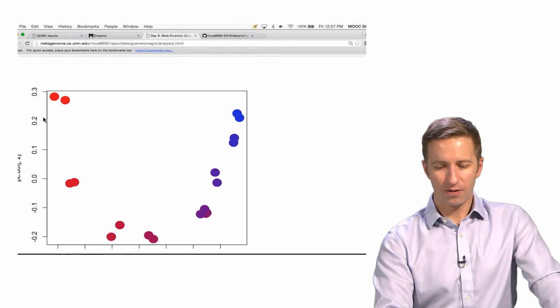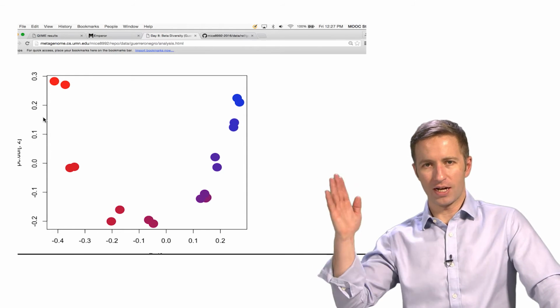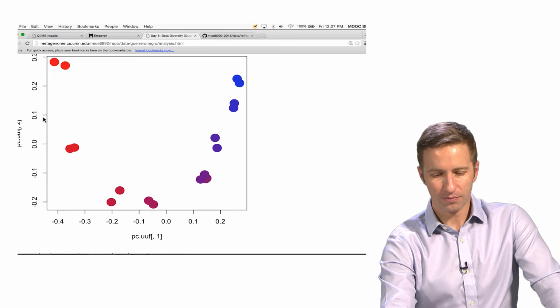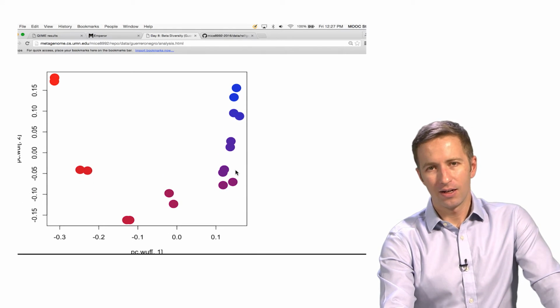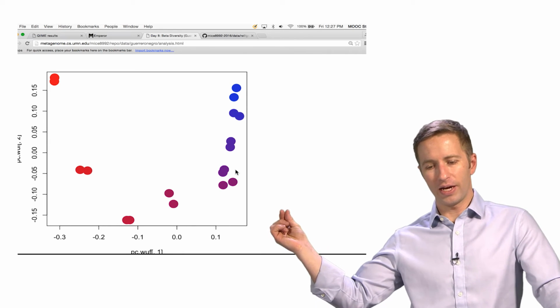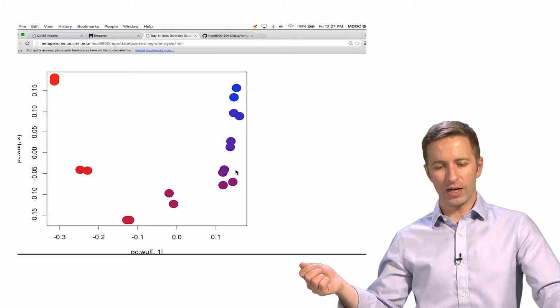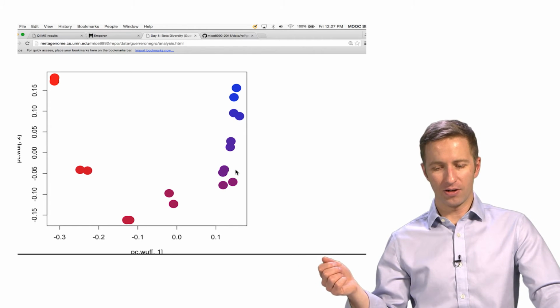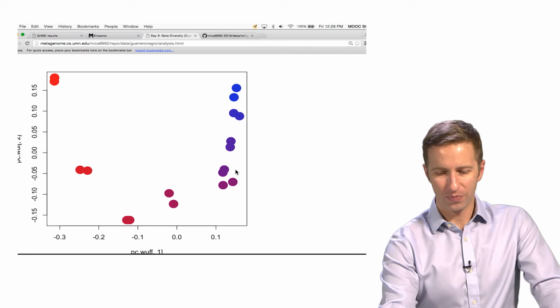Now let's plot unweighted UniFrac. So here's what we get for the sample. Looks pretty good, actually. Basically comparable to chi-square in terms of recovering that gradient on the first axis. Let's look at weighted UniFrac. Not bad, but it's collapsing one of the ends of the distribution. So it looks here like the unweighted does better at telling the difference between different layers in the microbial mat.